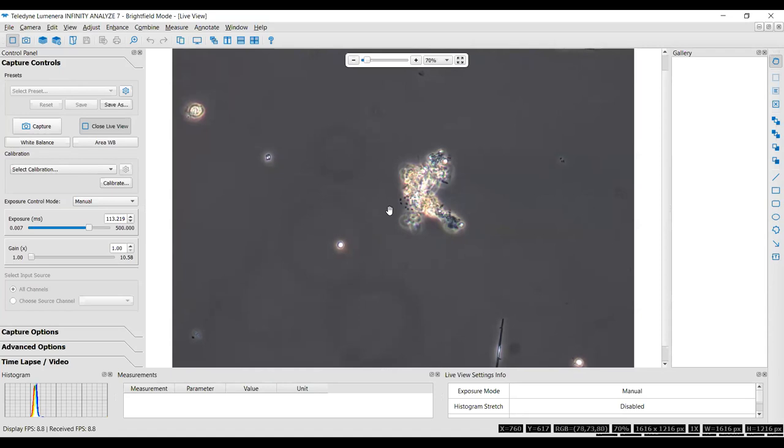Now, I had a question earlier about whether it is better to analyze your samples within 6 months. My clients would be happy sometimes if I was within those 6 months. It is better. However, doing the season all at once means that if a structure shows up, like an akinete, a heterocyte, a reproductive form, or the stupid Chlamydomonas for once doesn't drop its flagella, or something blooms that was rare earlier, then if you're a bit of a splitter, you have a chance to correct your earlier counts. If I have the luxury of a field season, especially a new one, and I can't get live material, which I only get maybe 10, 15, 20% of the time, it does help to do the whole season at one time.